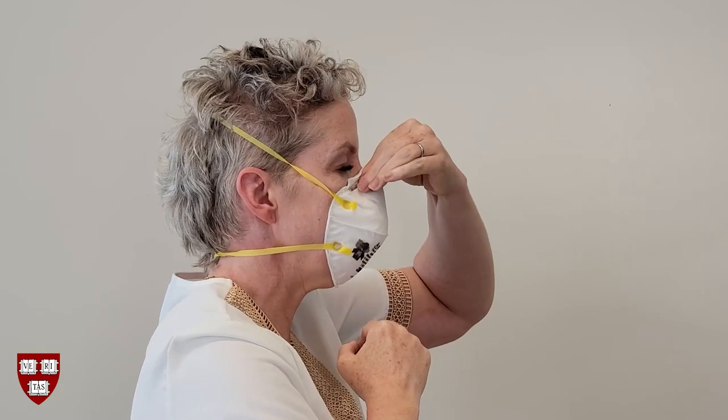Cup your hands over the filtering facepiece body. Thoroughly but gently cover it — don't press down. Sharply exhale and inhale several times. You should feel and/or sense no leaks. Make any adjustments if you feel leaks and repeat the test. If you cannot get the filtering facepiece to fit you without leaking, try another one. If it doesn't fit you without leaks, you may need a different type of filtering facepiece.